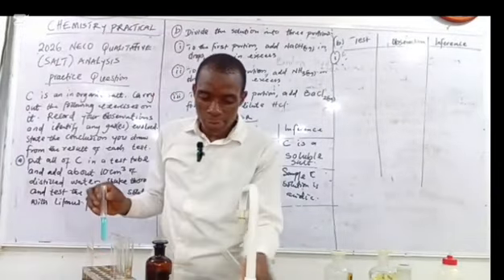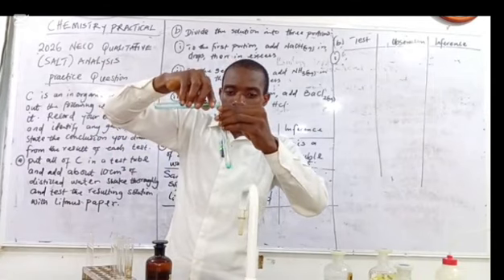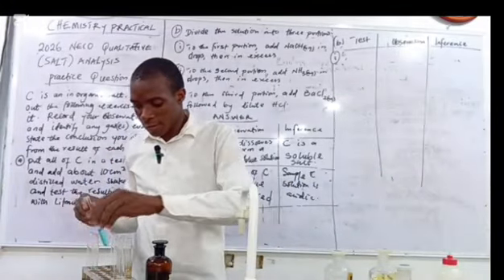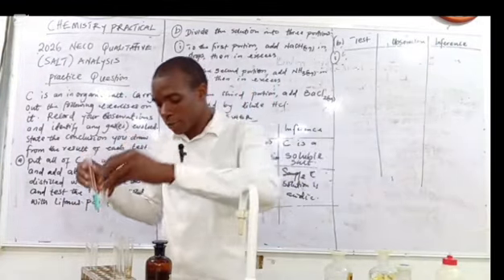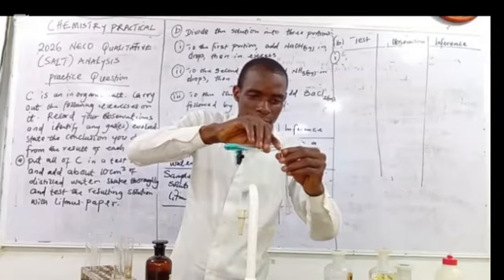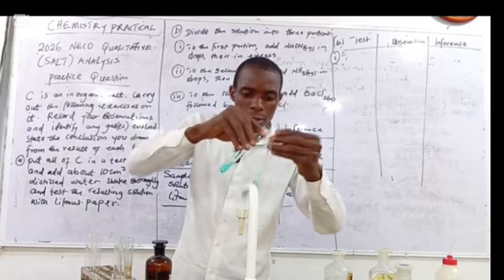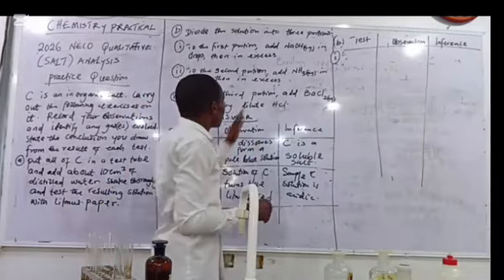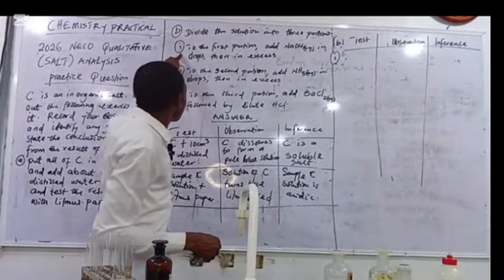So this is my first test tube, just a little portion, 3 portions. Okay, it's enough. So that's first portion. Then yeah, that's second portion. It's too much, so I'll find a way to reduce it. Okay, that's the third portion. That's okay. All right. So we have divided the solution of sample C into 3 portions. So let's carry out this test and see the first portion.